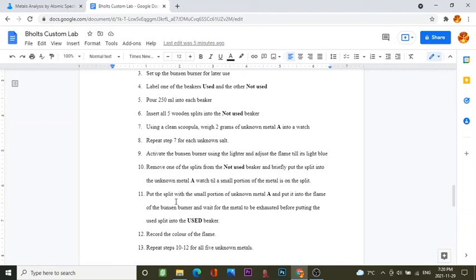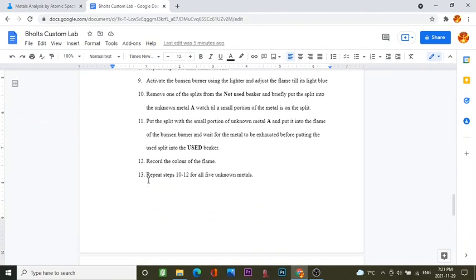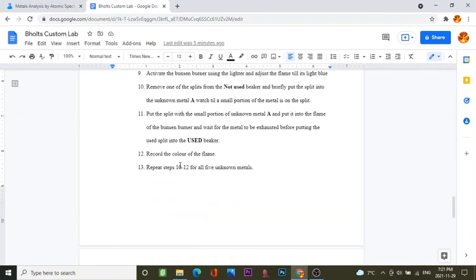Step 12 is to record the color of the flame whilst the unknown metal was in the flame on the splint. And the final step of this is repeat steps 10 through 12 for all of the 5 unknown metals. That way we can get a reading for each of the metals, because we're trying to identify all 5.